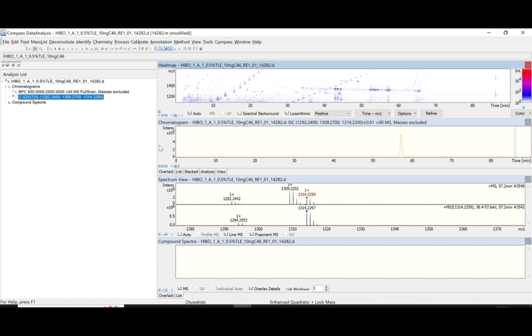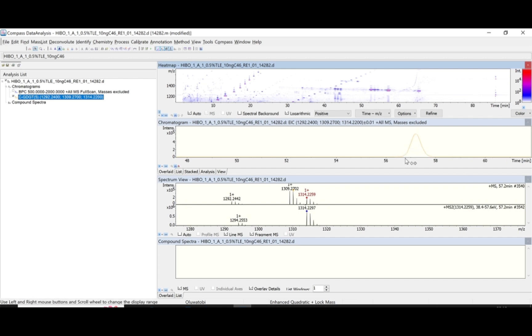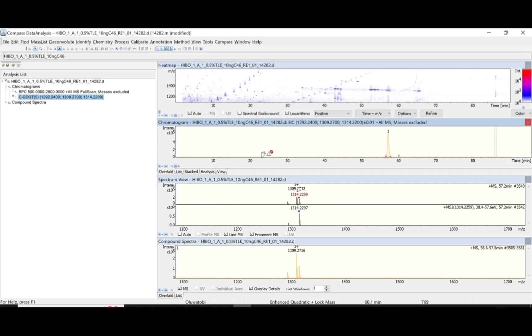After confirming that this is a compound — confirmed from both the retention time and the mass against the standard mass list — the next thing is to integrate the chromatogram compound manually. To do this, you draw a baseline from the base on one side of the peak to the base on the other side. It helps to zoom in first. I draw the line from base to base — perfect.